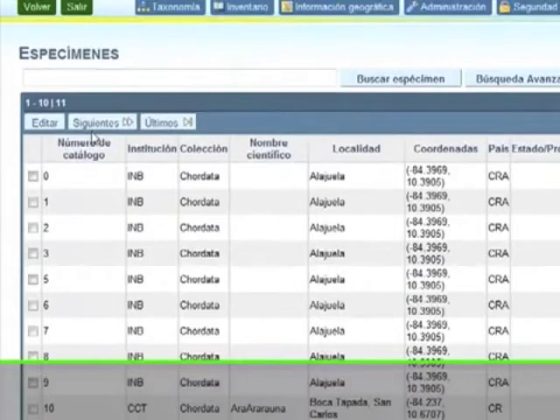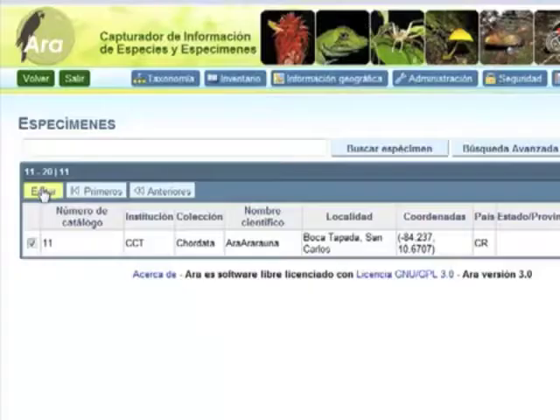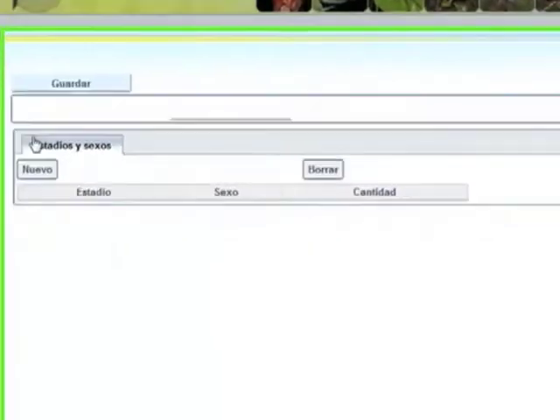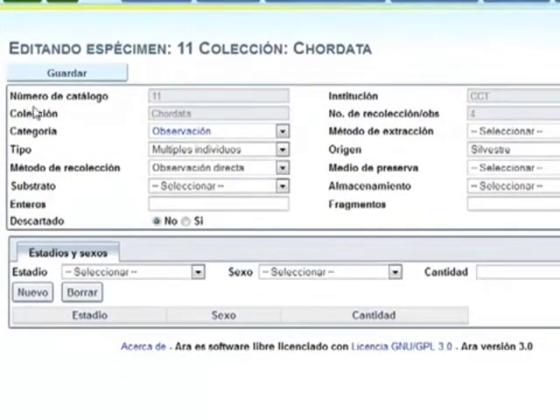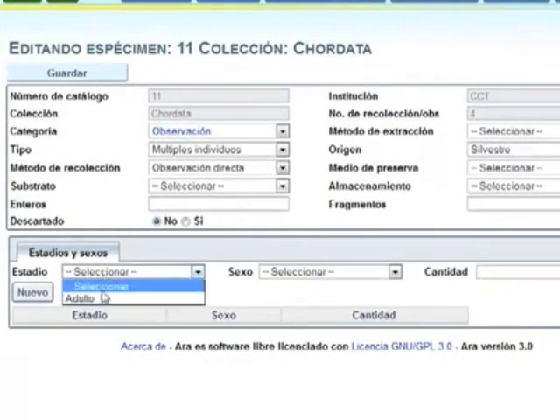In addition, you can browse your search by clicking on the next tab. To edit it, just select a specimen and click on the edit option. The changes performed should be saved.